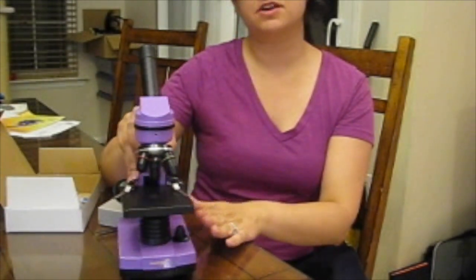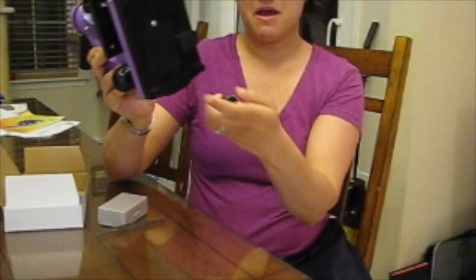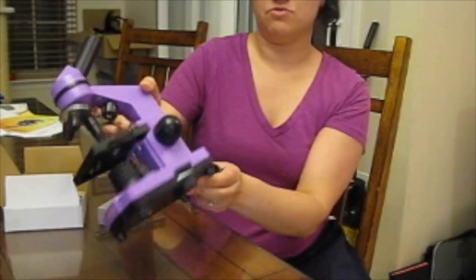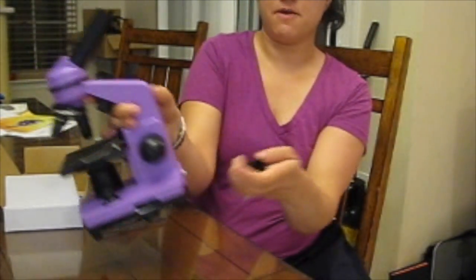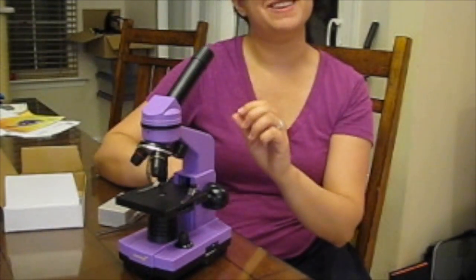The light sources can run - whoops, my lens piece just fell out. Not a big deal. You can either run off of the AA batteries or there's an included power cord that plugs in back here. I've mostly just been using the batteries so far. Let me put that eyepiece back in. There we go.